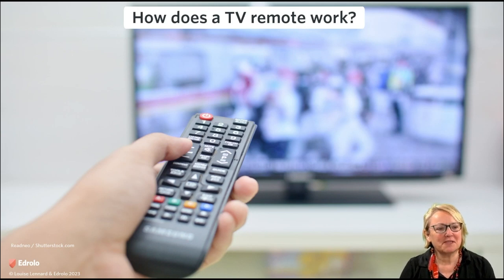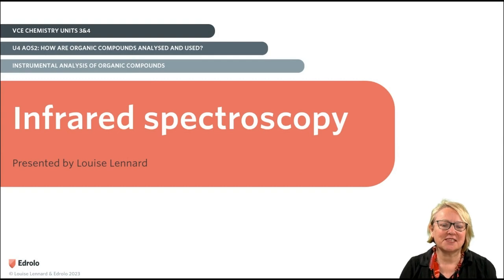You might have wondered how your TV remote works. Well, when you press the buttons, you're actually transmitting infrared radiation to your television, and that's what controls the station and the volume and so on. We're going to use infrared radiation to understand how infrared spectroscopy works in this lesson. So in this lesson we're looking at infrared spectroscopy.